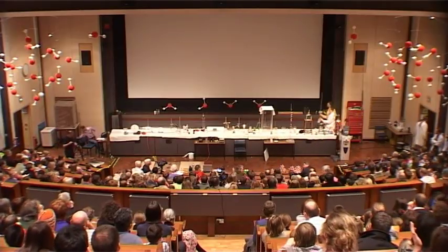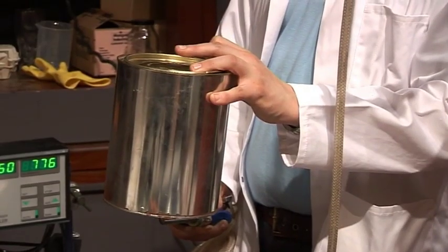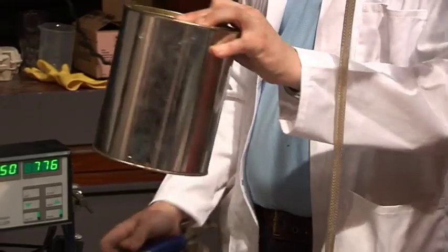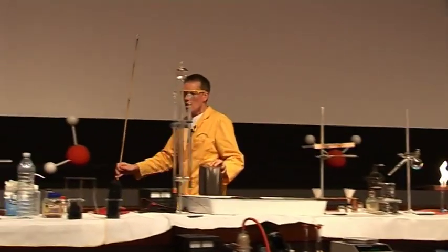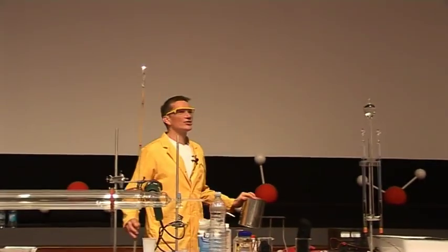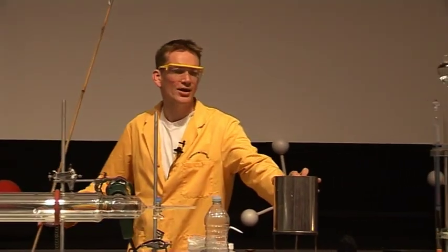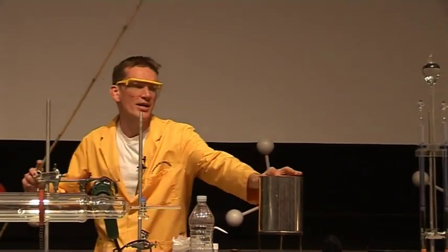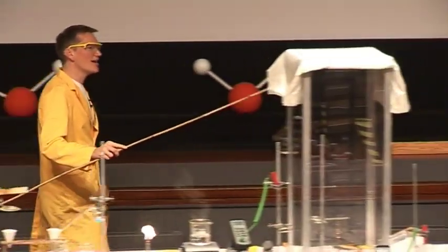Okay, well, we can use the results of that experiment there to understand the next reaction. Mark's just filling up a tin can for me with hydrogen. So this tin can contains pure hydrogen gas, and it's got a little hole in the top. And I'm just about to light it. Okay, are we ready? There we are. And there's another one over here, and I'll light that one.